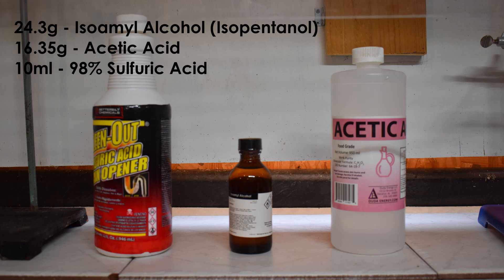To make this compound, I used 24.3 grams of isoamyl alcohol, 16.35 grams of glacial acetic acid, and to catalyze the reaction, I used 10 milliliters of concentrated sulfuric acid.